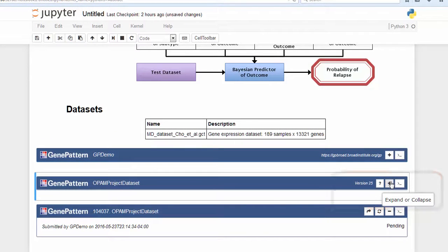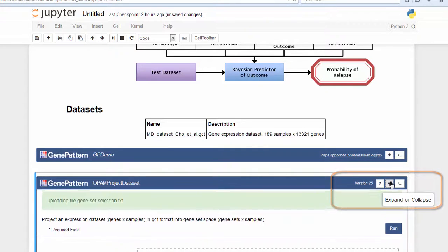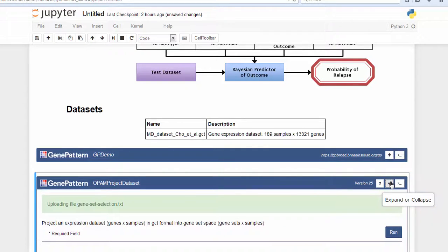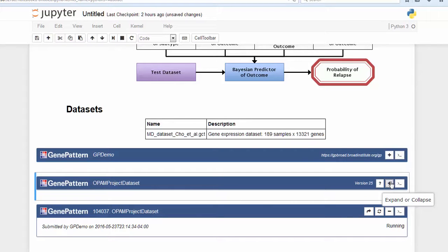To expand a collapsed cell, simply click on the plus sign in the upper right-hand corner. Previously, researchers who wanted to include their analyses in a notebook would have had to do so through written code. GenePattern notebook removes that requirement, providing hundreds of methods for the analysis of genomic data.